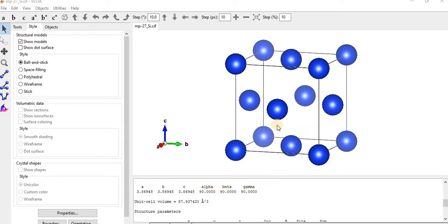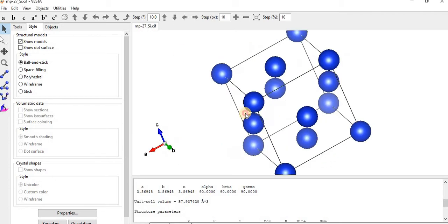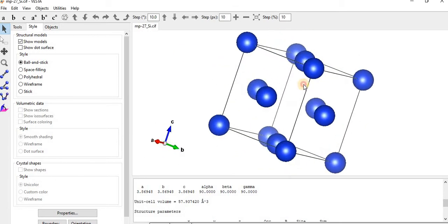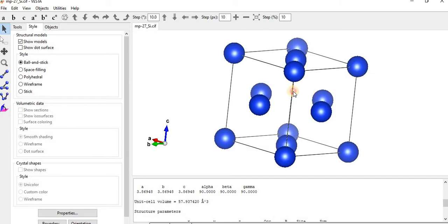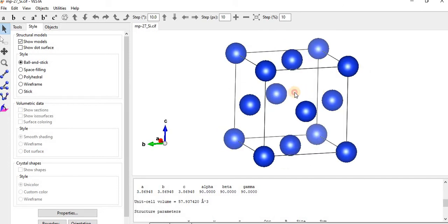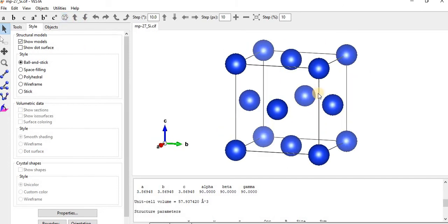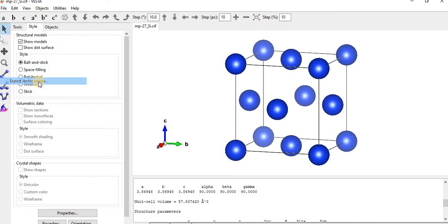So let me show you how to export the image. If you want to export this image, we can change the visualization of the crystal in different ways. This is the standard origin of the crystal. I want to export this image for using in different purposes, like writing a manuscript. Click on File, next come to Vector Image.